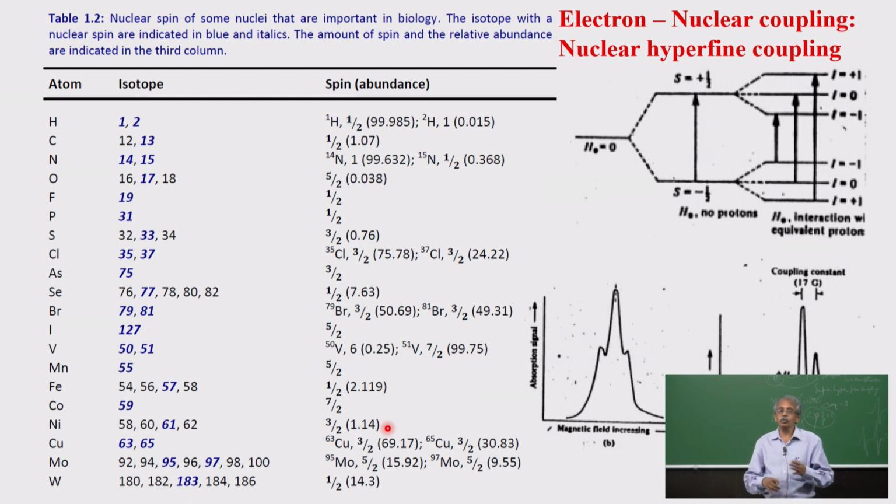That is why, in most microorganisms, when they generate metalloenzymes, they feed the input of the iron salt as 57-labeled iron salt and the nickel as 61-labeled salt. Then the proteins developed in their body all utilize 57 iron and 61 nickel, which becomes 100%, and then you can get a very good EPR signal.